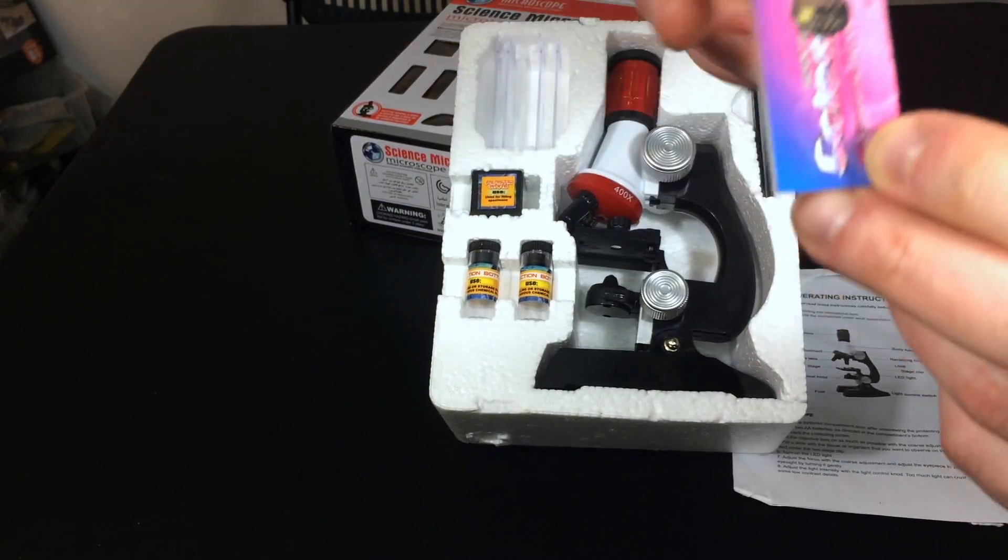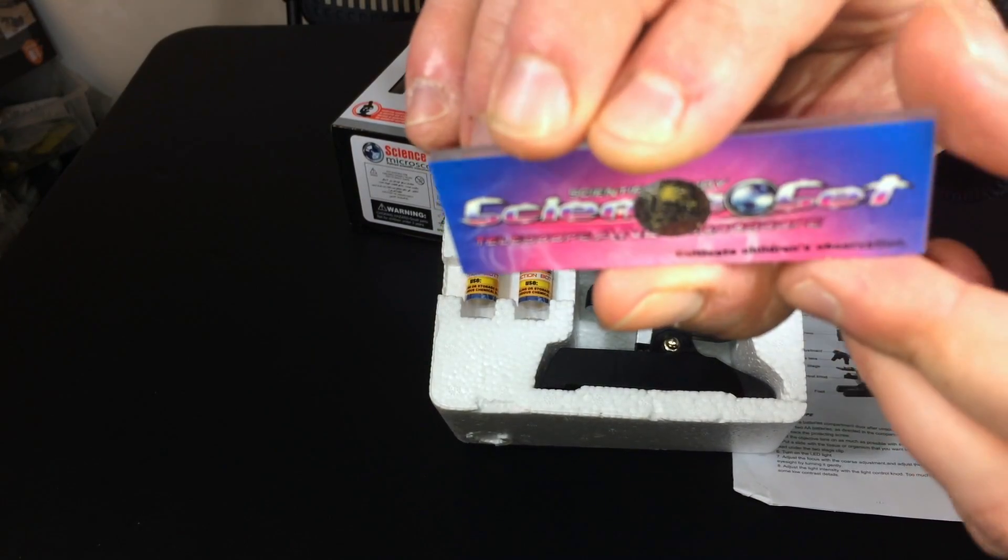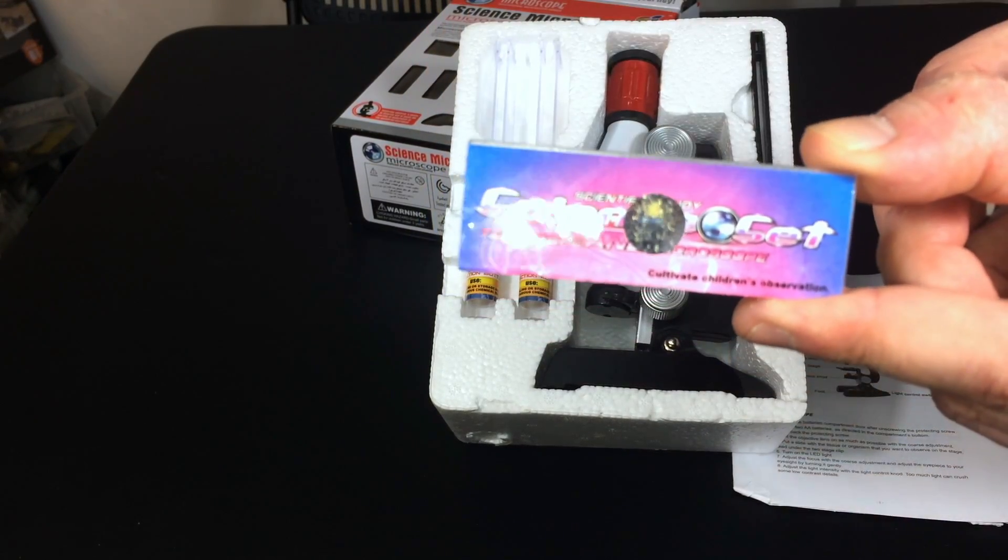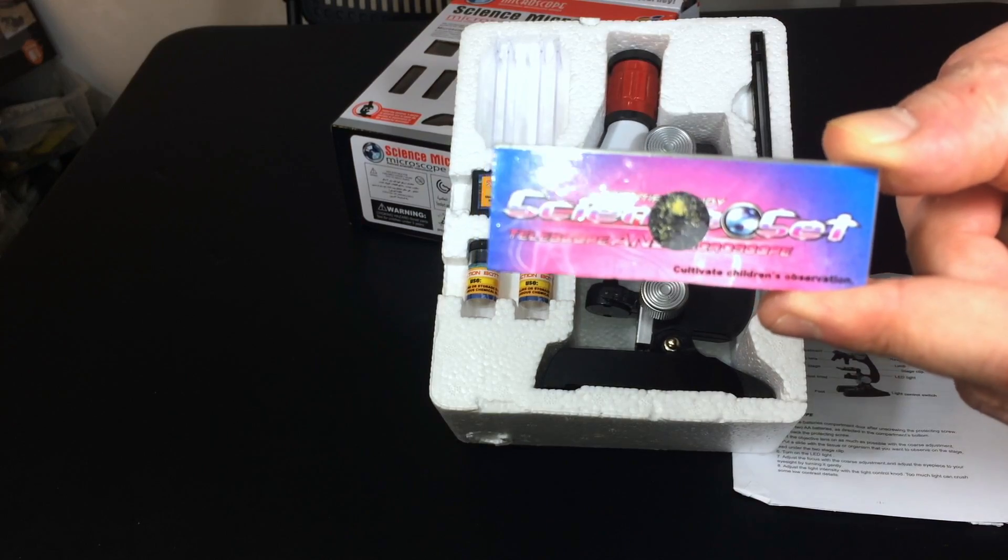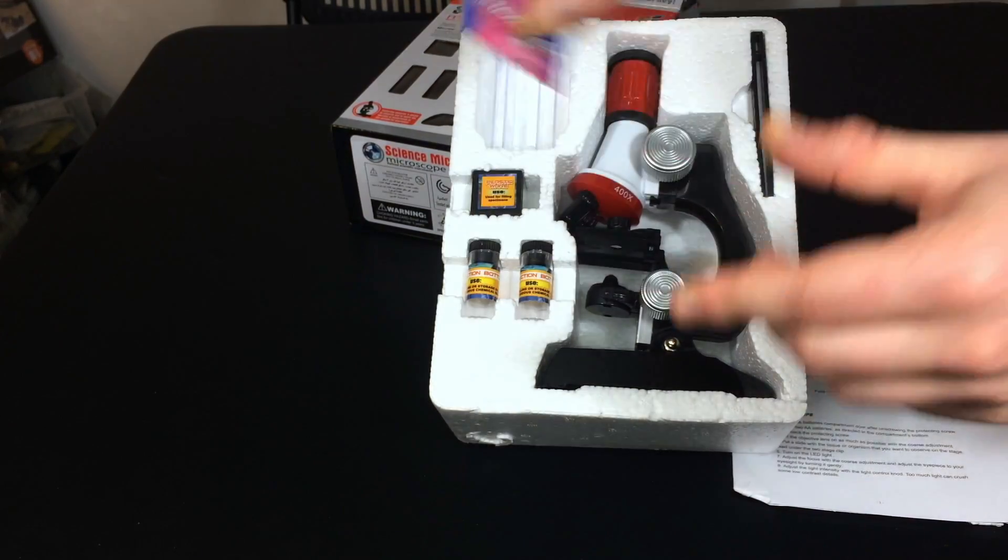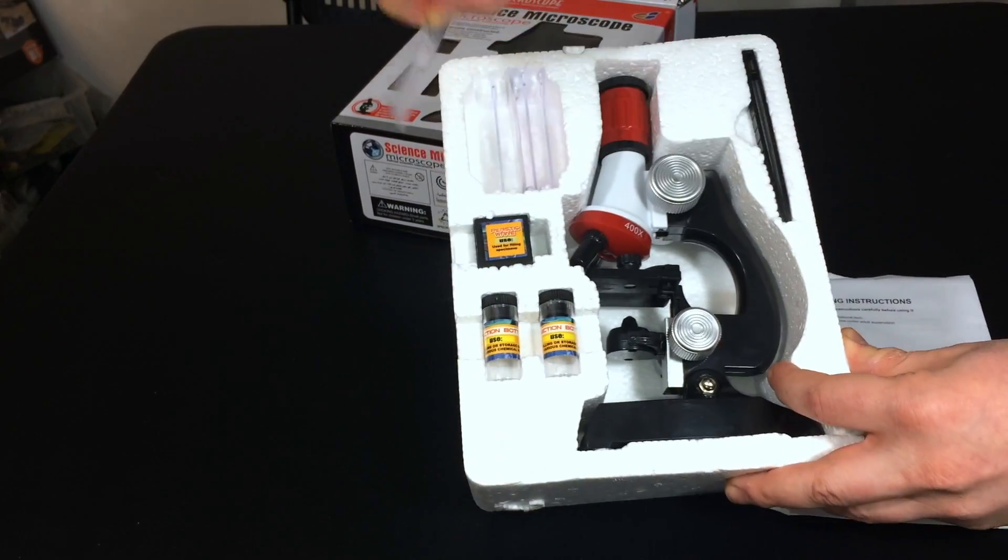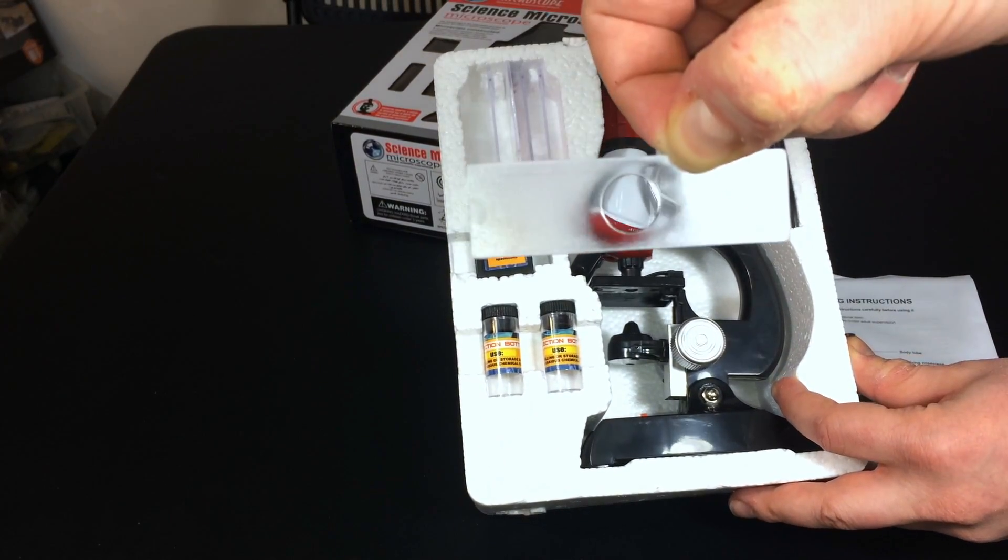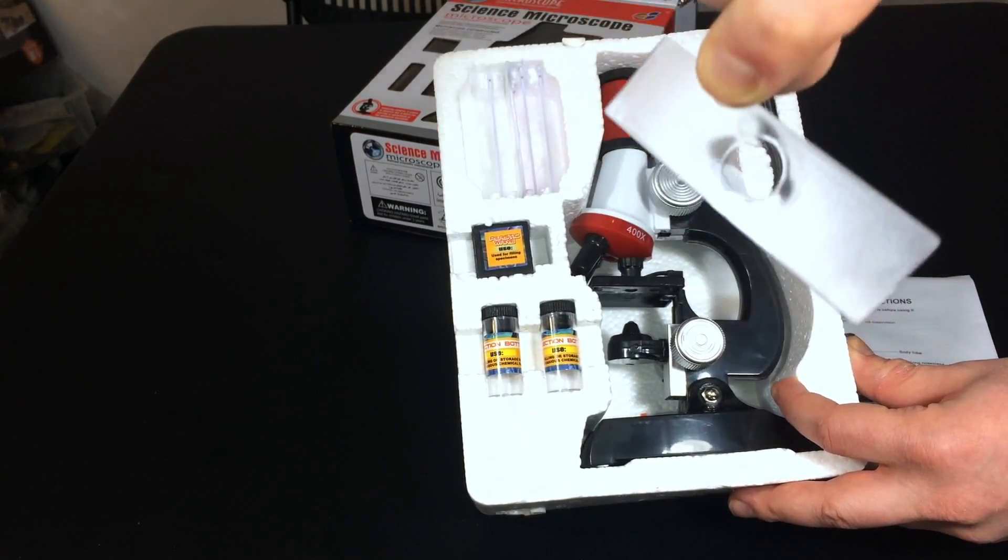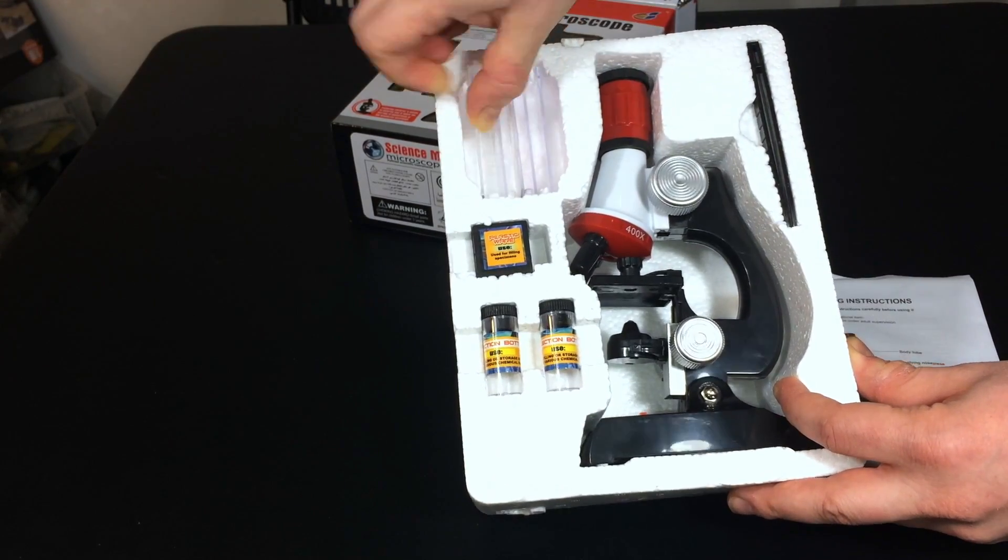As I read it right here, it doesn't really tell you what it is. But we'll be interested to see if we could use the magnification to our benefit here. Let's put those back. We also have a couple of clear slides, which we can prepare slides ourselves and be able to put this under the objective lens of the microscope.